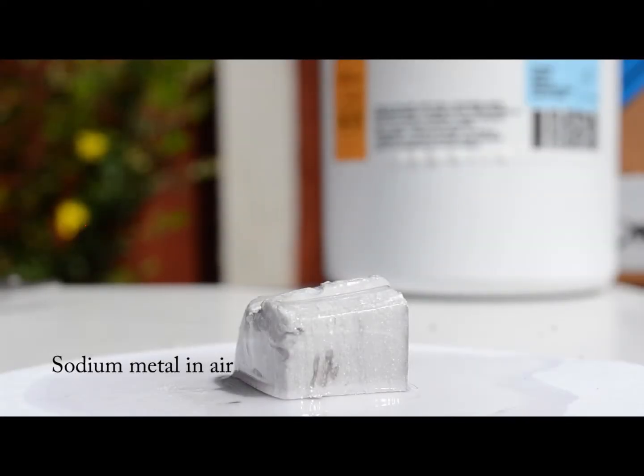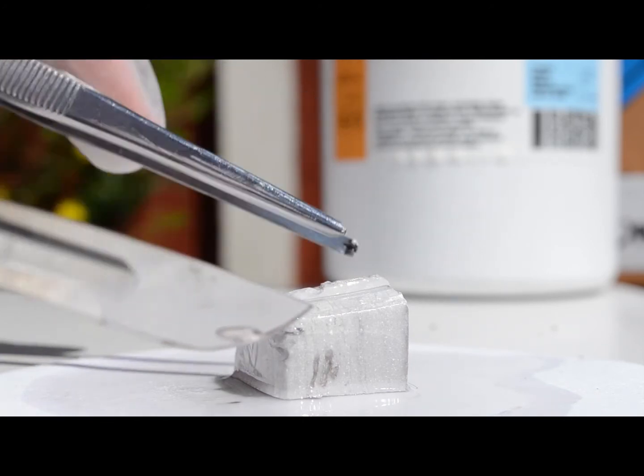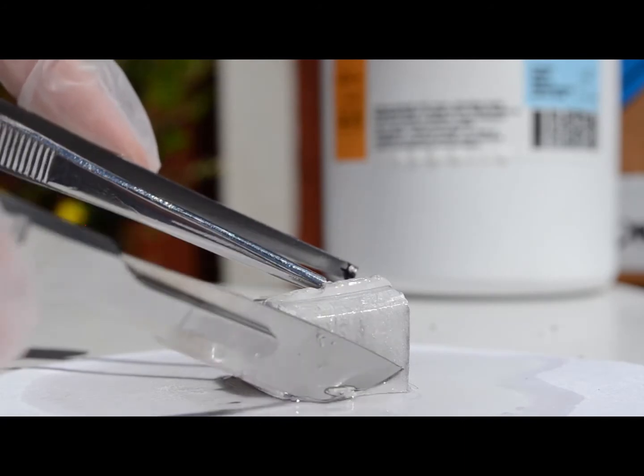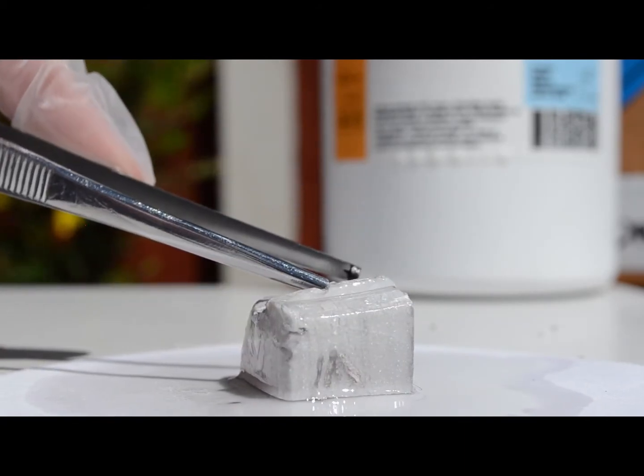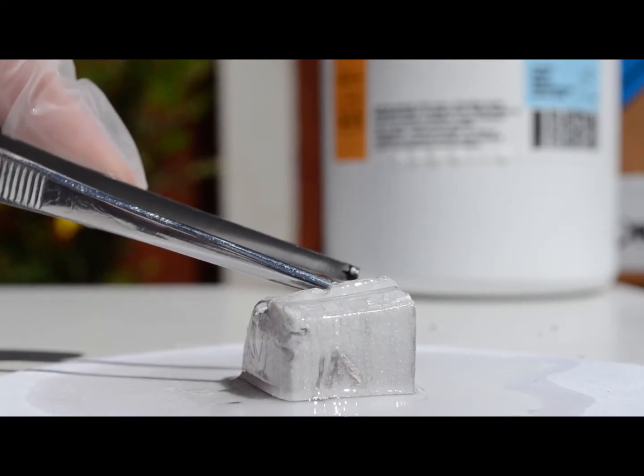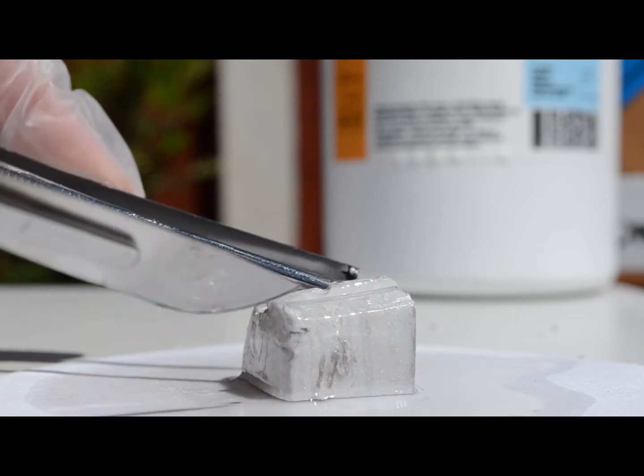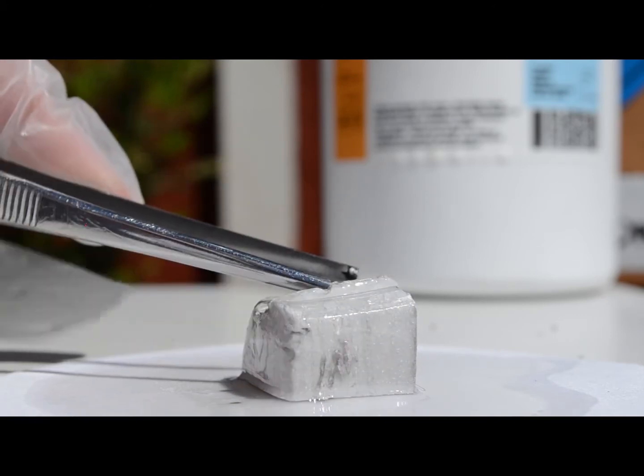This is a piece of sodium metal. You can see the white coating on there - that is a layer of sodium hydroxide. Because it's so reactive, it reacts with the air around us to form sodium hydroxide. It's actually the water vapor in the air that it reacts with to get this layer.